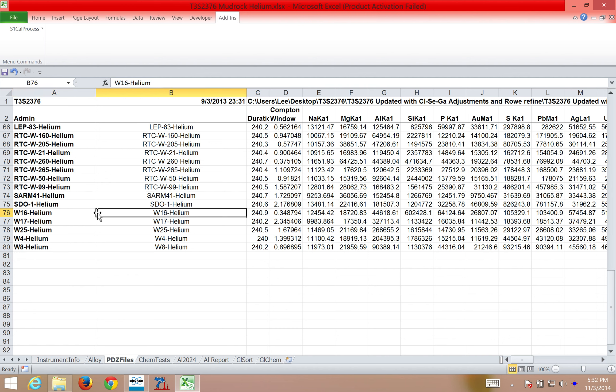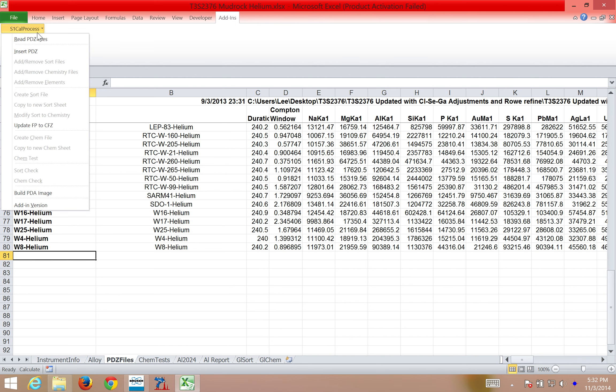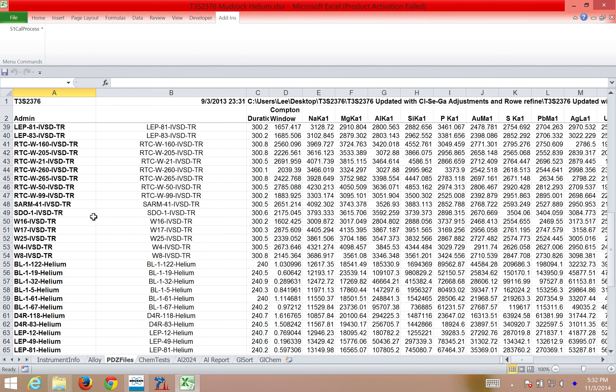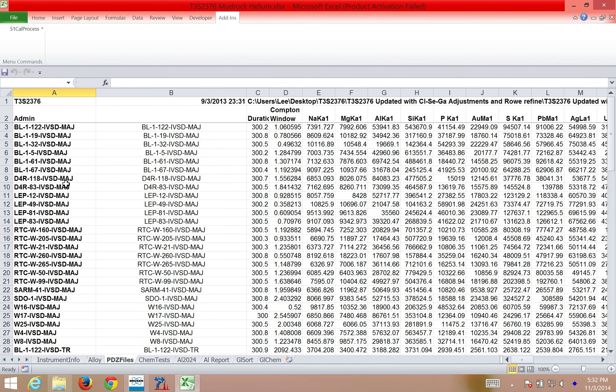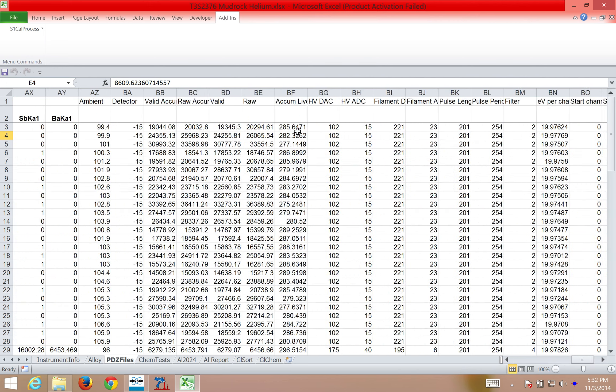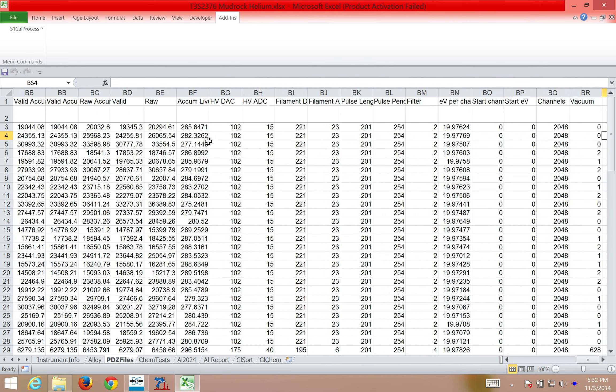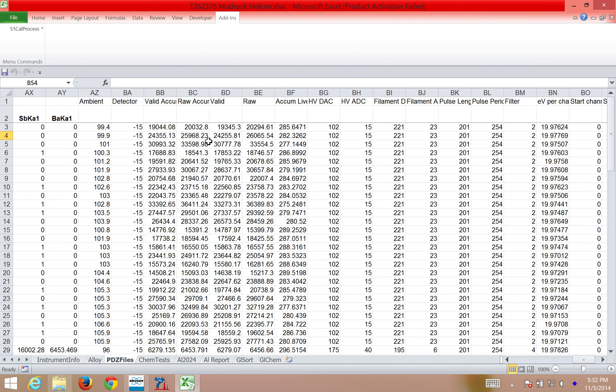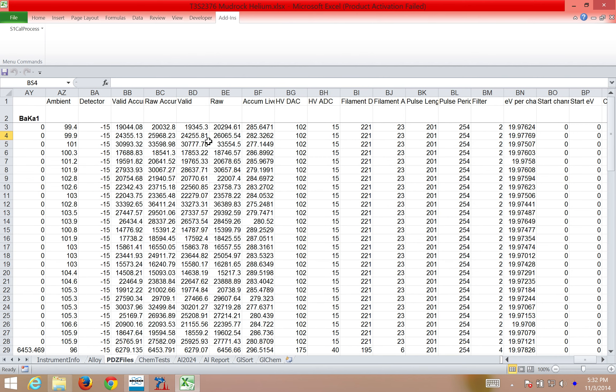So in this case, my first step is going to be to insert spectra that I want to quantify. So here in PDZ files, it's this tab in the spreadsheet, I have multiple PDZ files here. These are of my reference spectra. I can see the duration, Compton window, number of photons beneath each peak, and if I come way over here, I can get information about how the data was collected. The valid count rate, raw count rate, energy, current, etc.